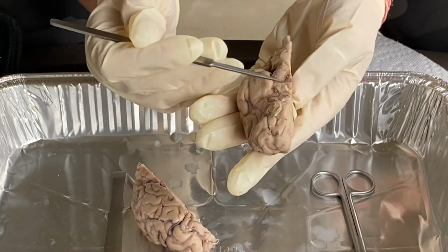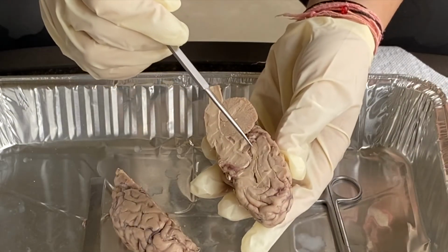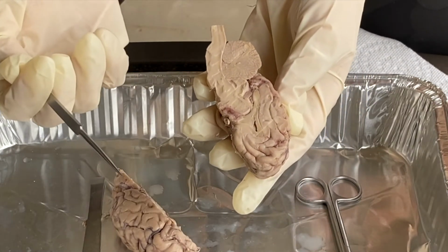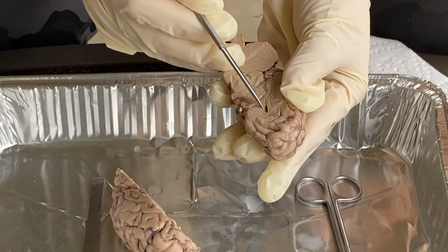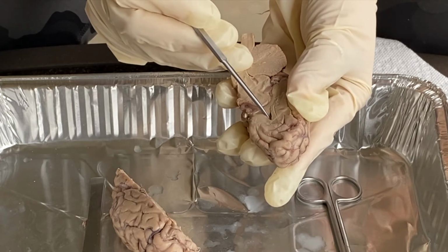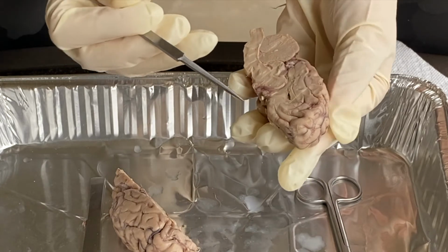I don't believe this brain has a pituitary gland here, because this is the hypothalamus, but I believe it's been cut off. Corpus callosum: the corpus callosum is the thick bundle of nerve fibers that ensures both sides of the brain can communicate and send signals to each other. And in this space right here, there's the septum pellucidum, which connects with the hippocampus and hypothalamus and kind of serves as a relay station between these structures. The septum pellucidum provides information to the rest of the body, generally about how the body is doing.